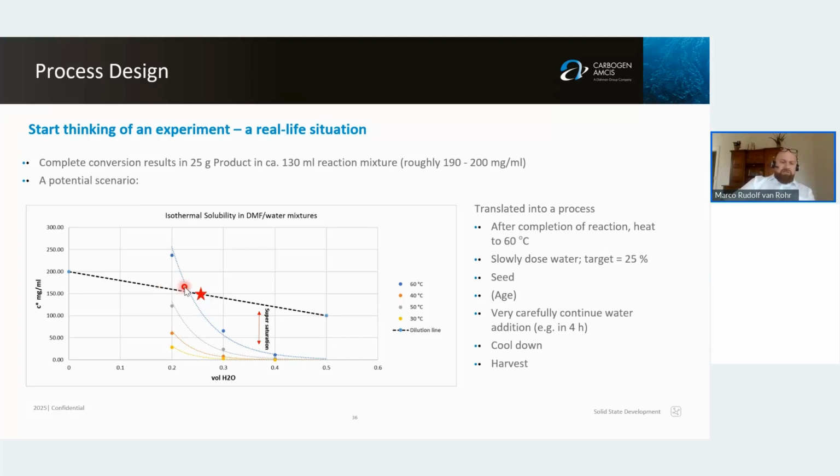I really like to do anti-solvent mediated crystallizations at high temperature. Mixing is better, growth kinetics are better, and you typically have fewer inclusions. So in my eyes, it's always better to do this at the highest possible temperature. Sure, you have to consider decomposition.